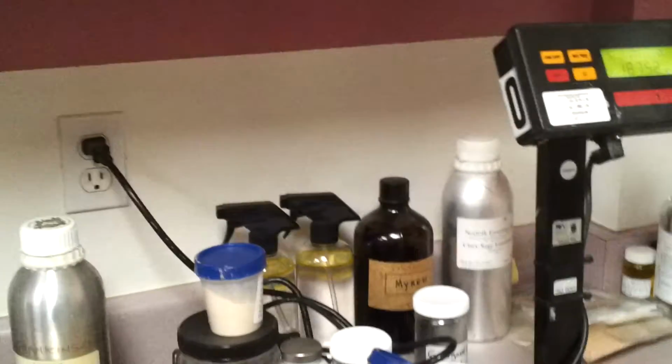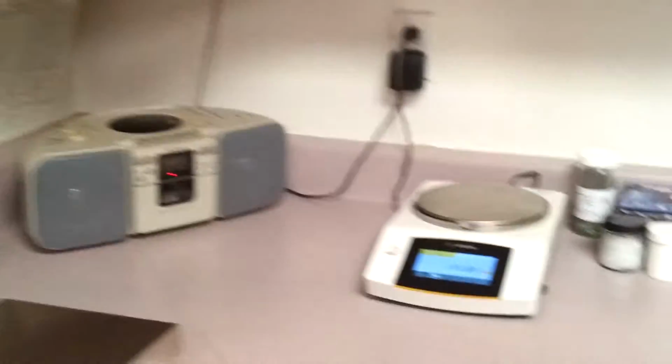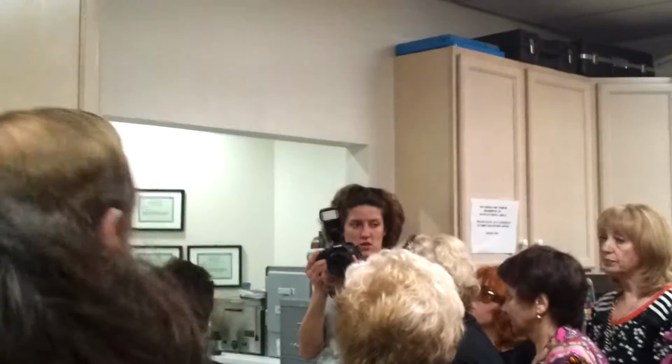идентифицирован. This machine uses a special diamond where the light goes through the diamond and examines the footprint of the ingredient. Эта машина использует бриллиант, свет идет через бриллиант, и таким образом мы проверяем соответствие этого ингредиента тому, что заявлено у поставщика. It must match all the programs in a computer or it gets rejected. Значит, это сканирование должно полностью совпасть в компьютерной программе, иначе мы будем отказываться от этого ингредиента.